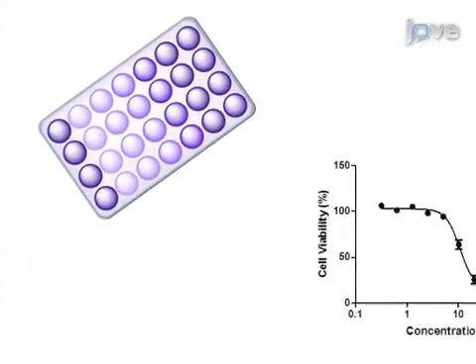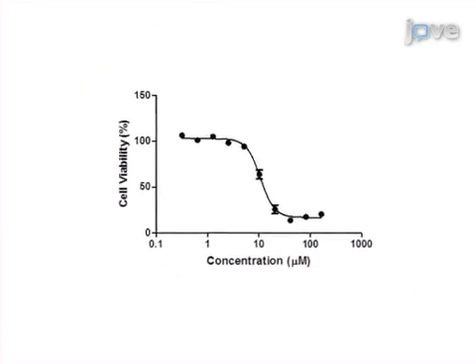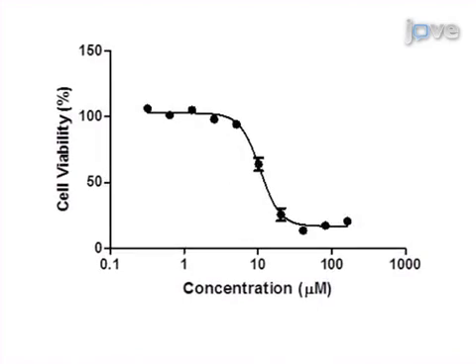The final step is to measure the cell viability by the MTT assay, where the reduction of MTT by mitochondrial and cytosolic enzymes to formazan is measured. Ultimately, the anti-cancer activity and half-maximal inhibitory concentration, or IC50 values of the compounds, are determined.